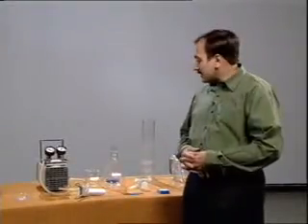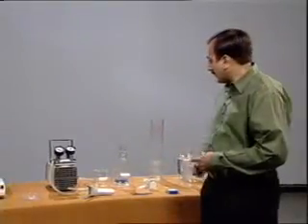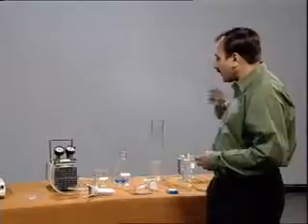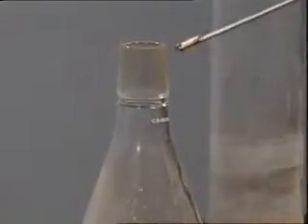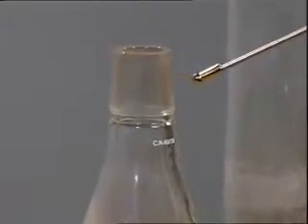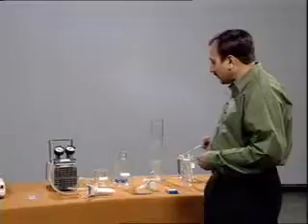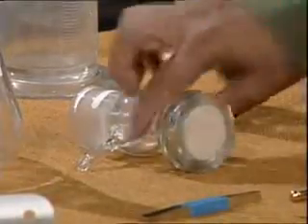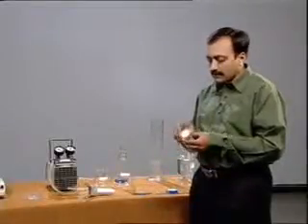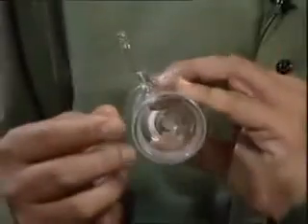The membrane filter assembly that we are going to use in this program comprises a flask of 1 liter capacity with ground glass top, a glass base with tubulated cap. This has a filter base and the bottom is ground glass.